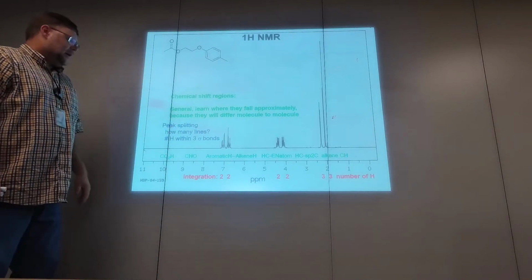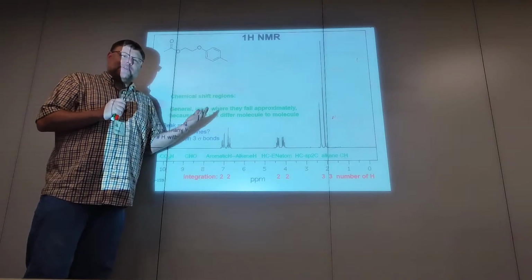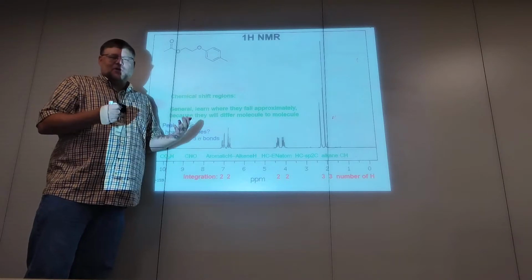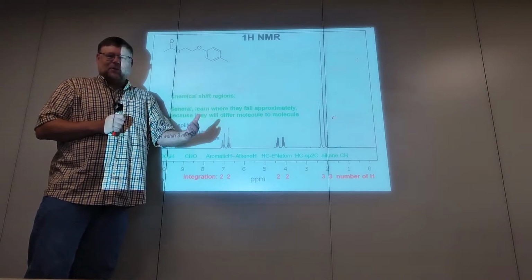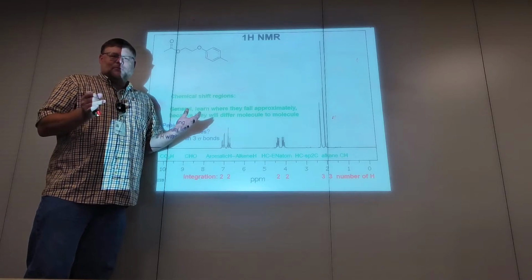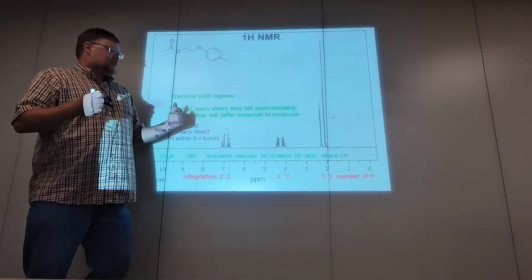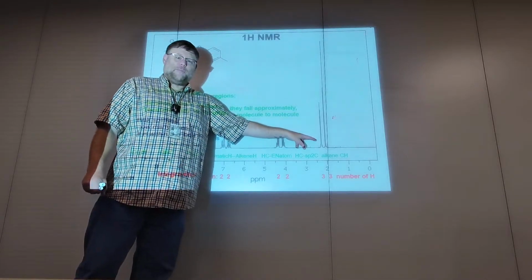Just like if you go back to the very beginning of the intro to spectroscopy, black coffee looks like black coffee, and you can tell how strong it is. Strong black coffee, it's black, you can't see through it, so you know it's strong. If it's brownish white, somebody's put cream in it. Just the same, you start to recognize what a methyl group bonded to an aromatic ring looks like.